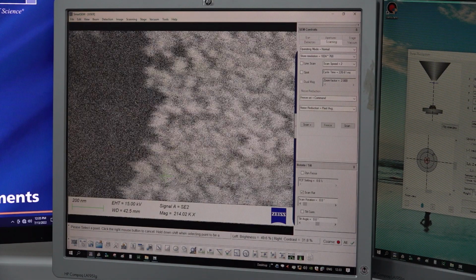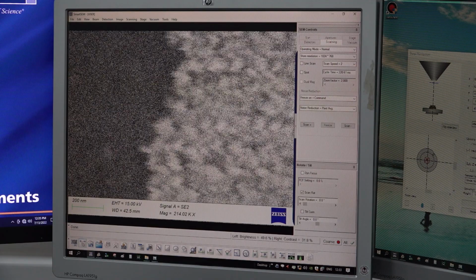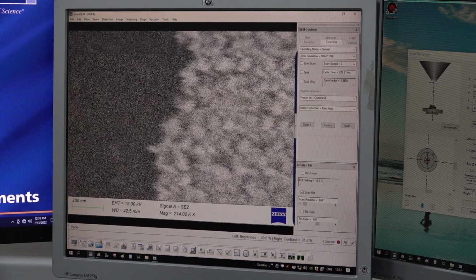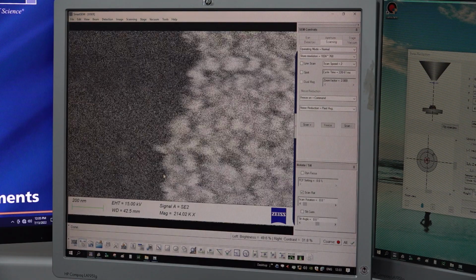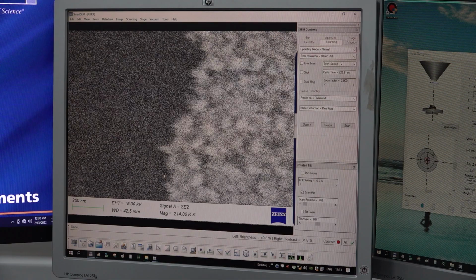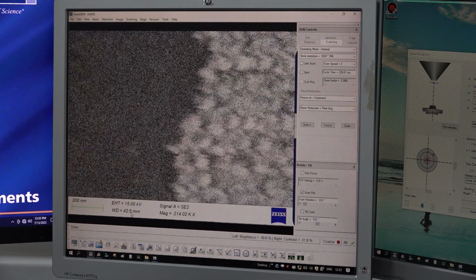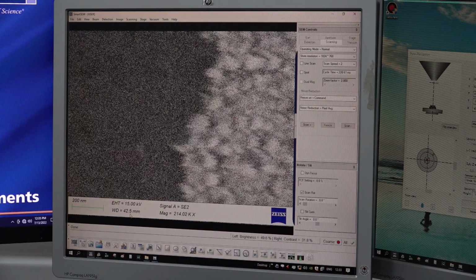First things first, every detector has been calibrated for a certain working distance range. For the secondary electron detector or Everhart-Thornley detector, that range is 7 to 12 mm. In a focused condition, your working distance should be 7 to 12 mm. For in-lens, you should be between 3 to 5 mm.